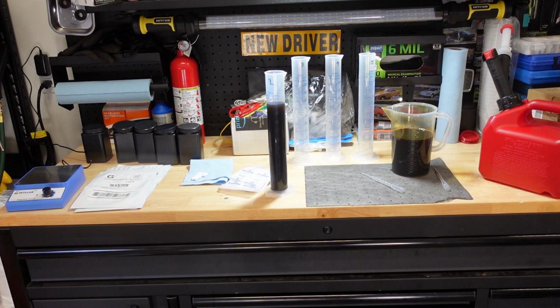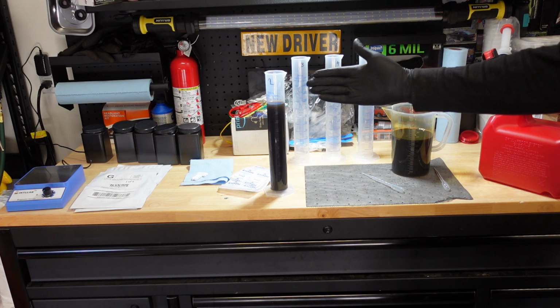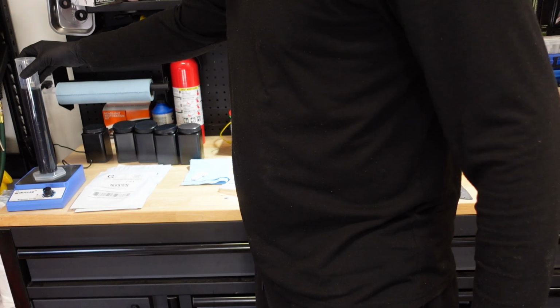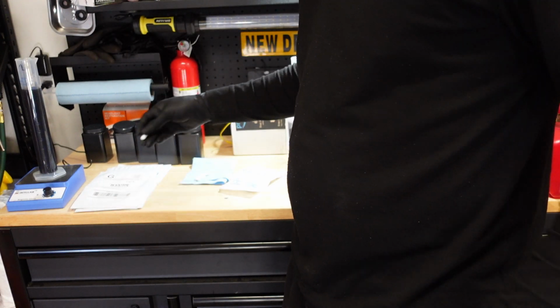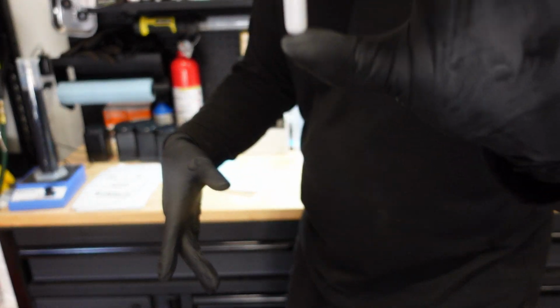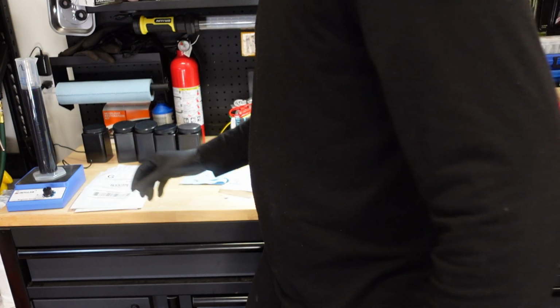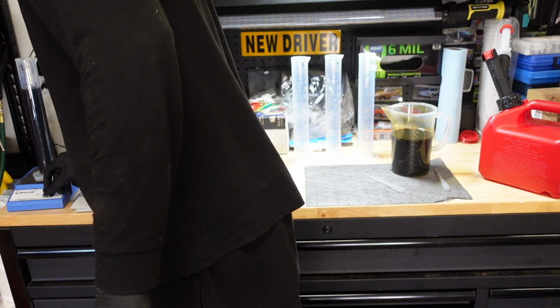Okay, now this right here is our starting point, 12.5% gas. So we're gonna set this right here on the stir plate. Now we're gonna take a little magnetic stir bar and just drop that right in there. Let that hit the bottom, and then we're gonna stir this up. And the idea is that I wanna let this, let me make sure it's stirring here.